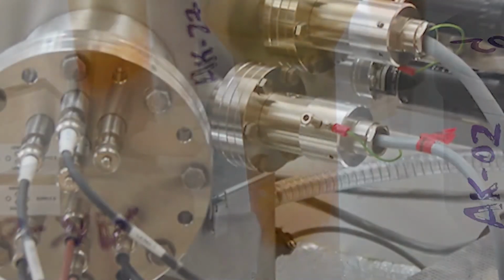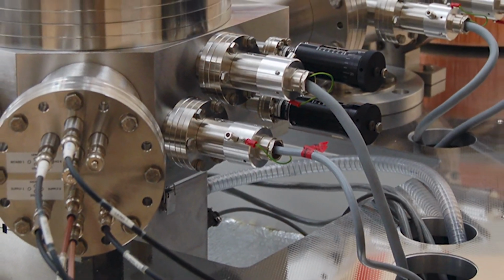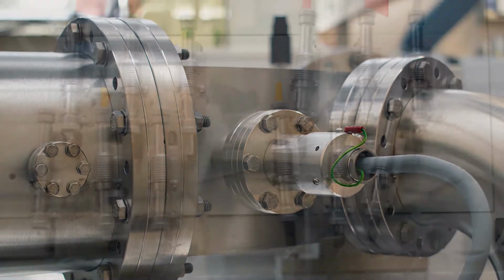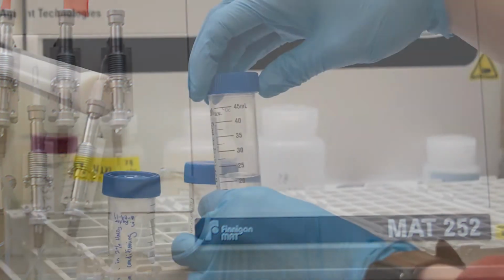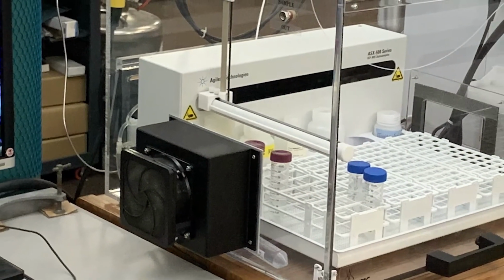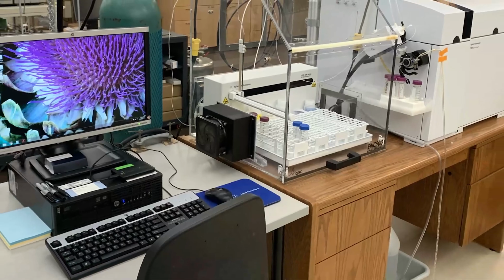Once we've purified our sample, then we're ready to run it on what's called a mass spectrometer. The mass spectrometer allows us to measure individual elements down to parts per trillion levels. So for every trillion atoms that we pass through it, we only need one or two of the element that we're interested in to be able to measure it. So again, we're going from a really hard solid rock into a solution, into something that's purified sometimes to just a single element, and then we're able to accurately measure that down to the parts per trillion level. So geochemistry is incredibly powerful to tell us a lot more about the Earth as it is now, as it was in the past, and how we can expect it may be in the future.